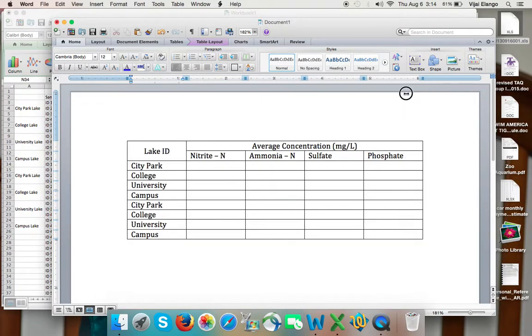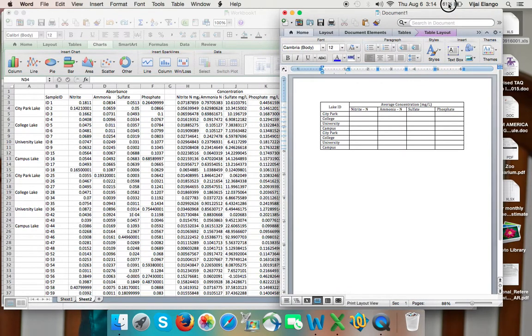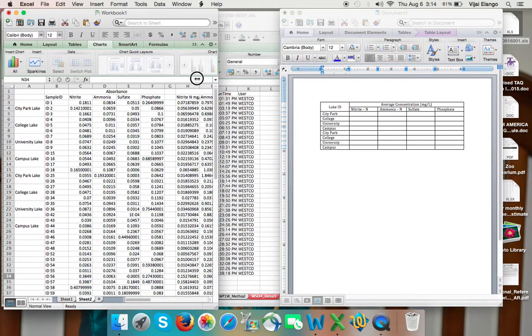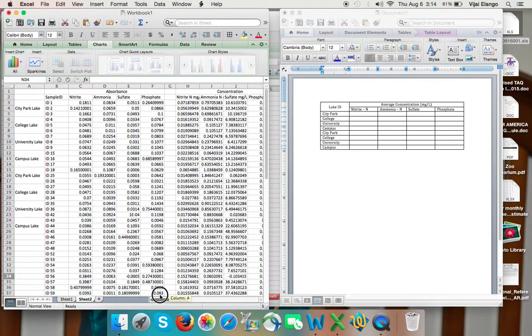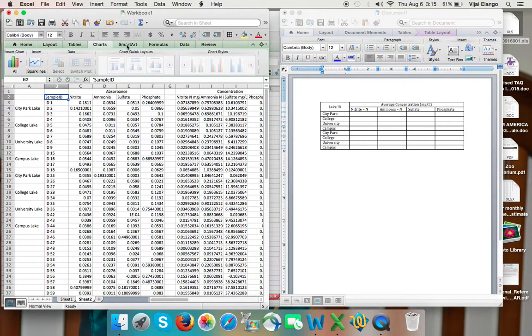I'm going to try to make this smaller, that way I can look at the numbers at the same time. What I can also do is come over here, go to view, and freeze the frame. Apparently I don't know how to do this here. Okay, now let's go on with this one.